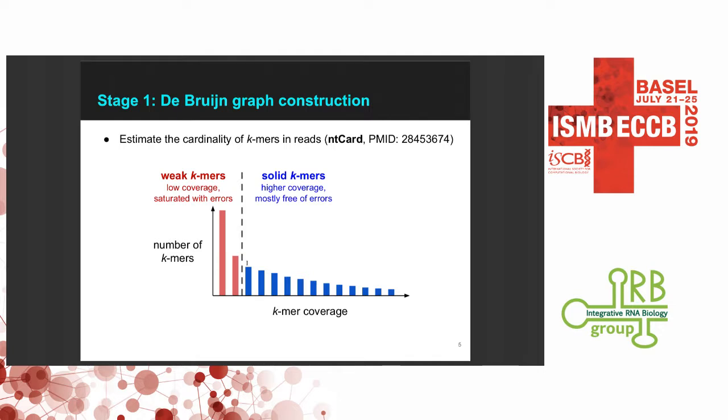So that means just because these K-mers map to multiple places, it doesn't mean that they actually contain errors, isn't it? No, the weak K-mers are only intended as candidates for error correction. Okay. So it doesn't mean that they will always be replaced in the error correction algorithm. It's just candidates for error correction.